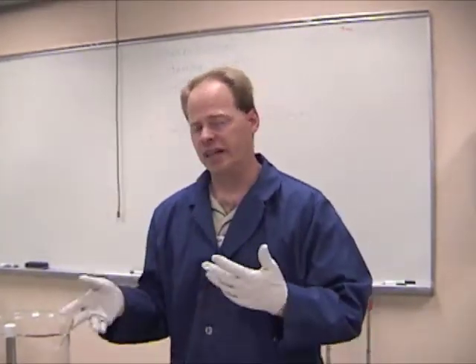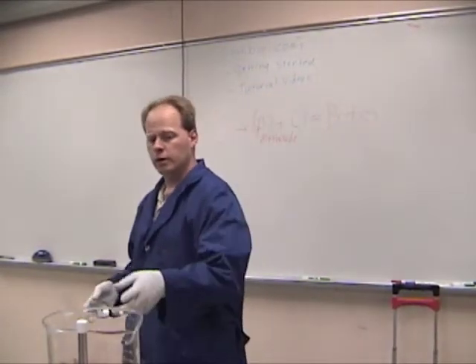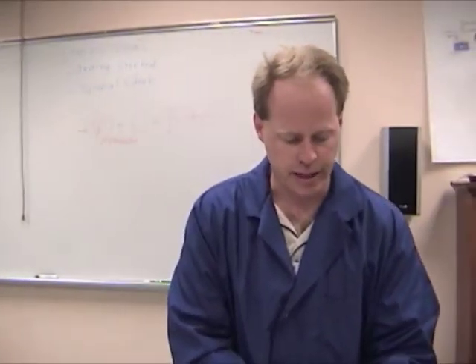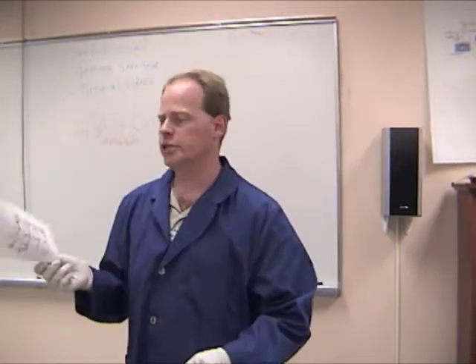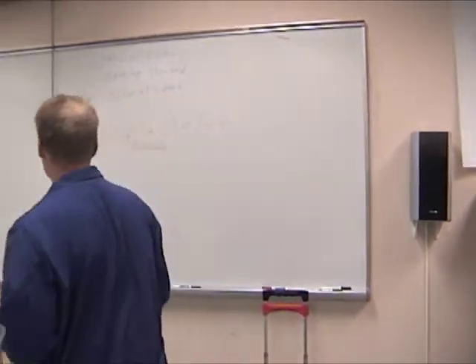Okay, this is mixed for about 10, 15 minutes. So I'm going to turn the stirrer off. The heat is off. We're going to just let that sit for a while as we get our titration ready. Okay. Go ahead and flip the page over for those of you that have this, and we're going to talk a little bit about titration.